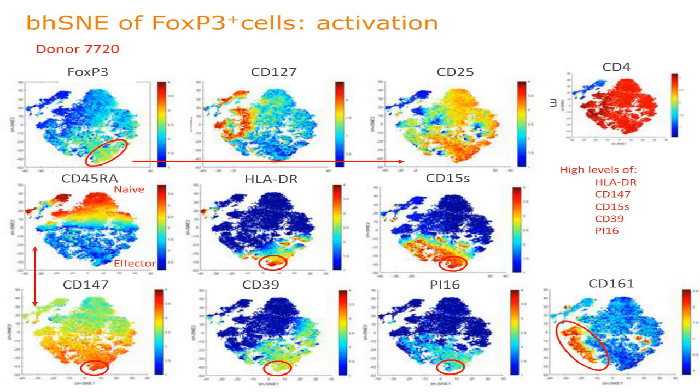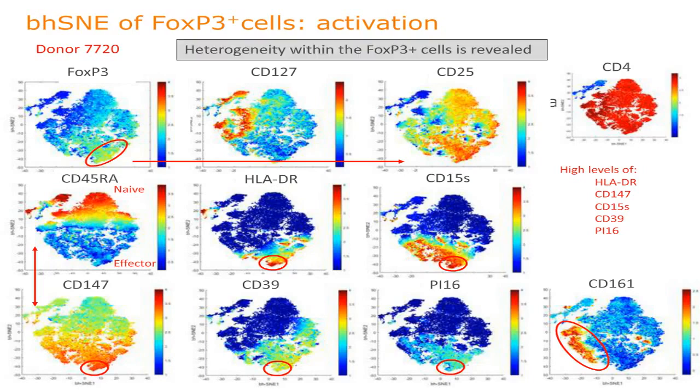They have a continual expression of CD147, and they also have a population that is CD127 high. So those, again, are different ways of being able to analyze your data using a computational analysis approach.